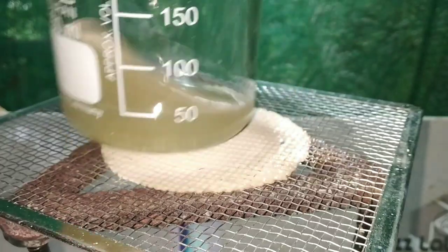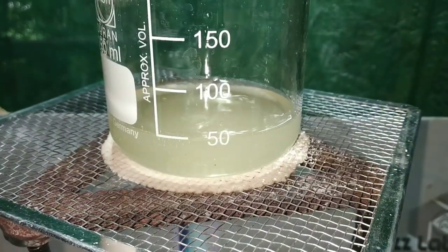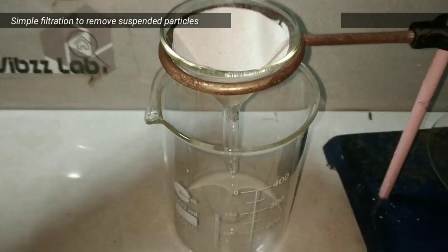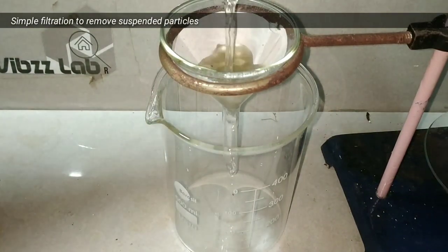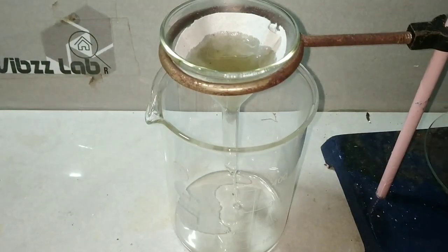After some time the solution turns clear, indicating all the suspended particles have reacted and the products have dissolved in water. When we see that the reaction is not progressing, we stop heating and then filter the solution to remove any unreacted particles.